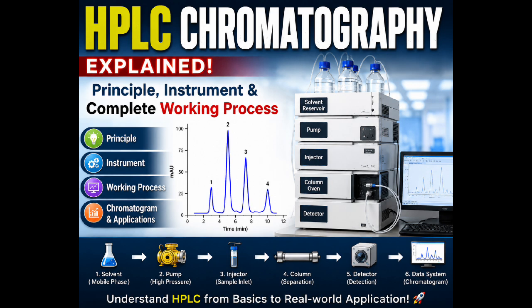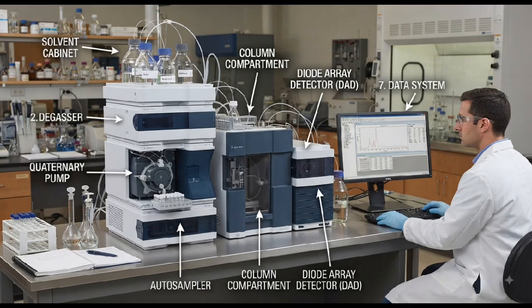In this video, we will break down HPLC chromatography from the basics, its principle, every major instrument component, complete working process, and how the final chromatogram is generated. So if you want to understand what is really happening inside an HPLC, stay with me till the end. Let's decode HPLC step by step.